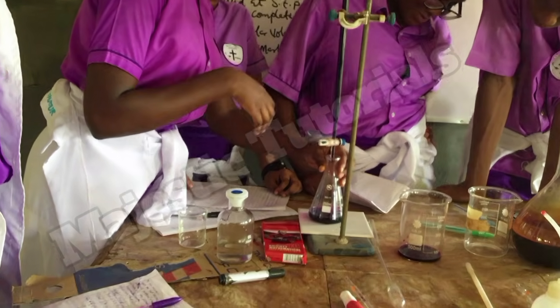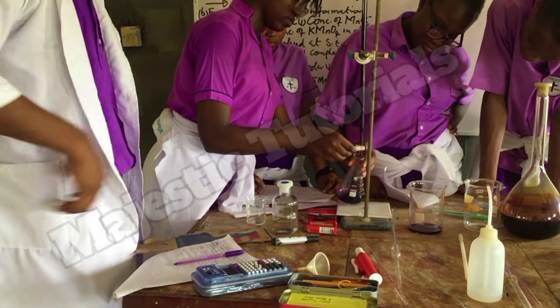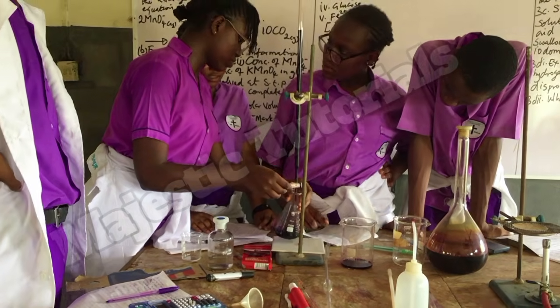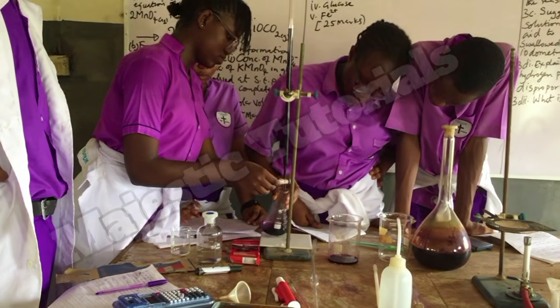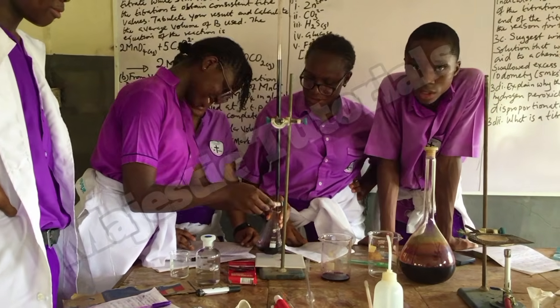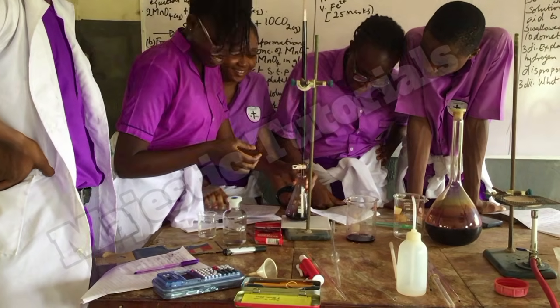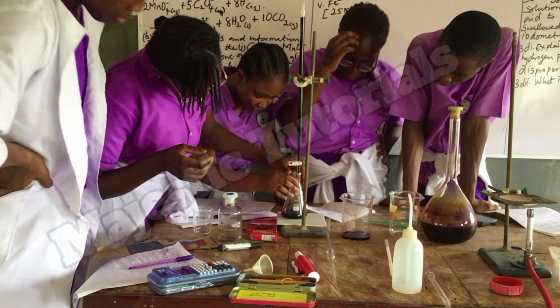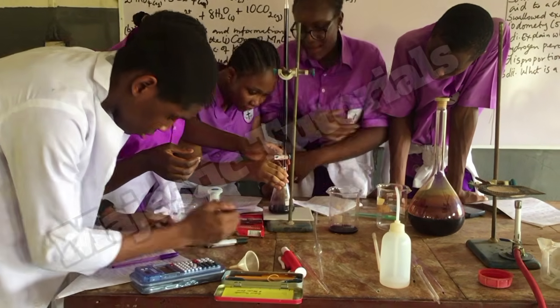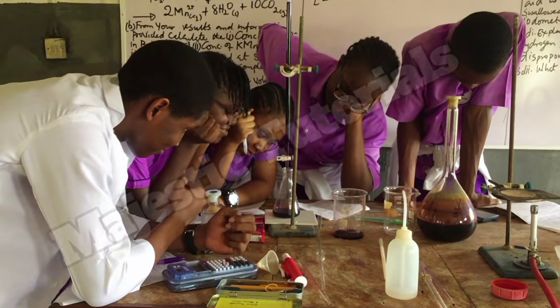That's why you are required to allow it, because the reaction between oxalic acid and KMnO4 is relatively slow, but on warming at a higher temperature it is fast, but you cannot heat it so high that the reaction will be immediate. So if you add, you watch it after some seconds. That's why the instructions say it will give you a pink coloration that will last for 30 seconds. After a few seconds, you see it will turn back colorless, showing that you have not attained endpoint.